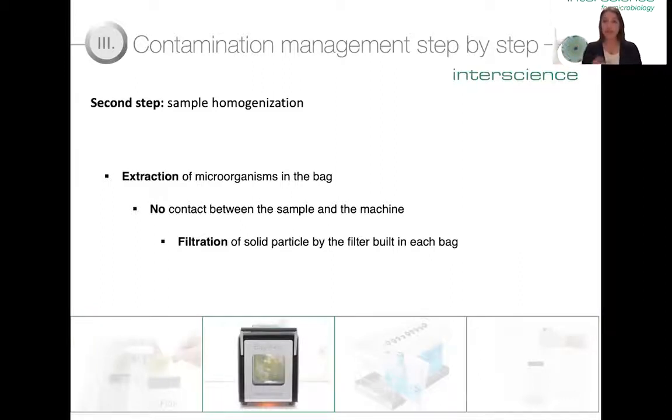An important thing to keep in mind here is to have a process where you can do the dilution and the homogenization in the same bag, because the fewer times you take the sample in and out or have to transfer things, the lower the risk of cross-contamination. That is where you get the most risk for cross-contamination: when you shift things in and out of the bag.